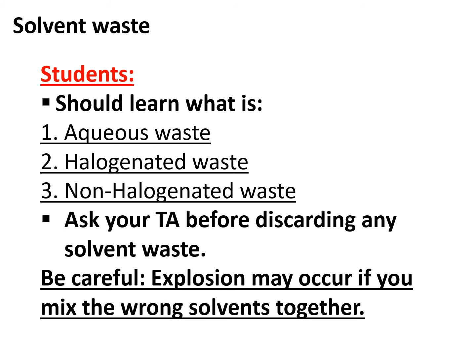Now, in terms of what type of waste is what, aqueous waste is anything where the solvent is water. So any dissolved salts, any acid or base solutions, stuff like that, those are always going to be your aqueous wastes. Now, for halogenated and non-halogenated waste, those are always organic-based, organic solvents.